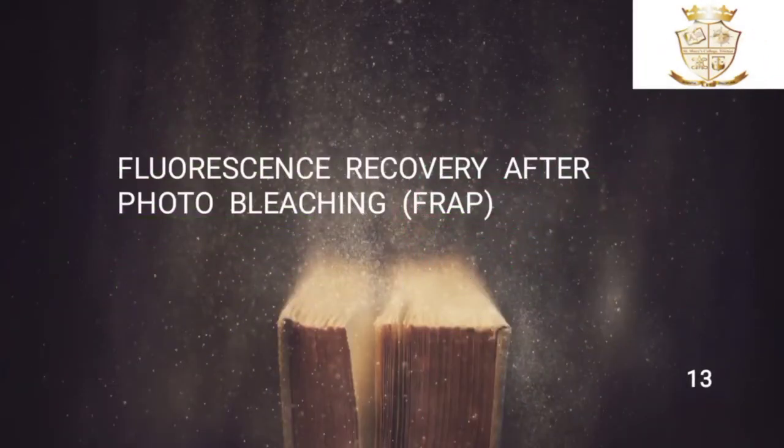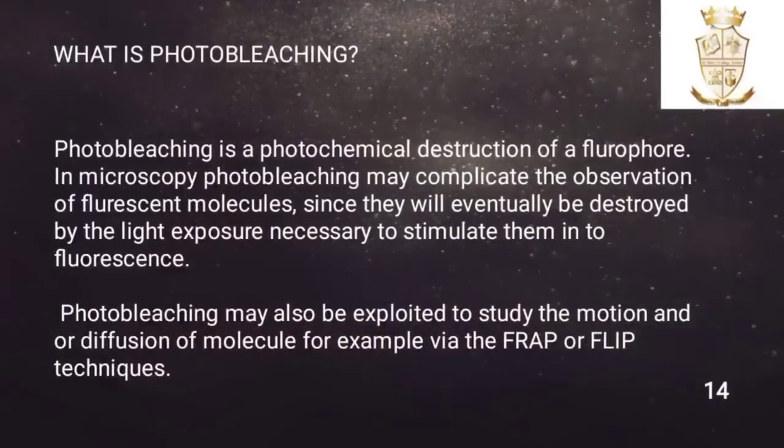Then the next topic is fluorescence recovery after photobleaching, FRAP for short. What is photobleaching? Photobleaching is the photochemical destruction of a fluorophore. In microscopy, photobleaching may complicate the observation of fluorescent molecules since they will eventually be destroyed by the light exposure necessary to stimulate them into fluorescence.